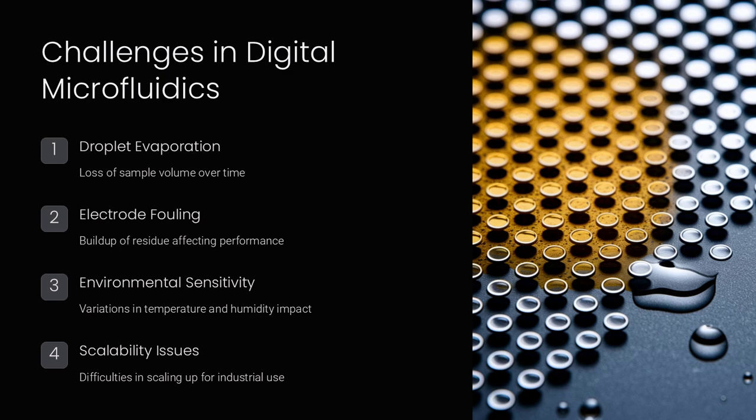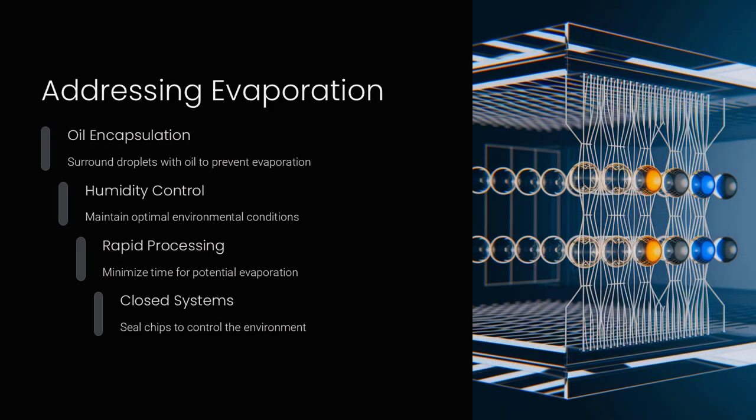In drug development, a digital microfluidic platform can conduct thousands of microreactions simultaneously while using only microliters of expensive compounds, thereby conserving valuable resources. It is like a precision chef who uses just the right amount of ingredients to prepare several dishes, ensuring nothing is wasted and every dish is perfectly balanced.